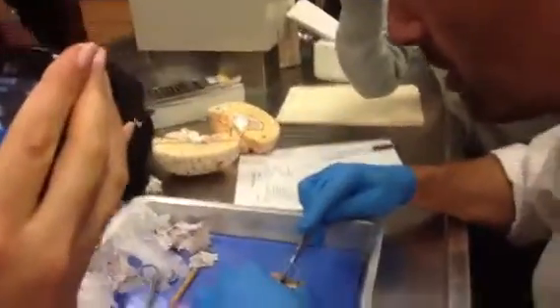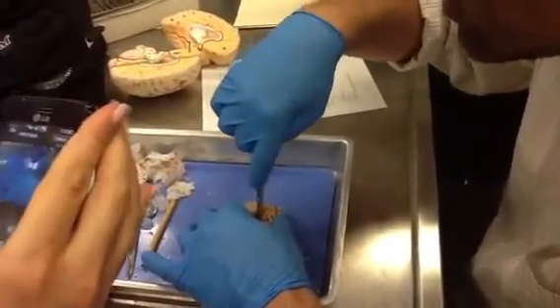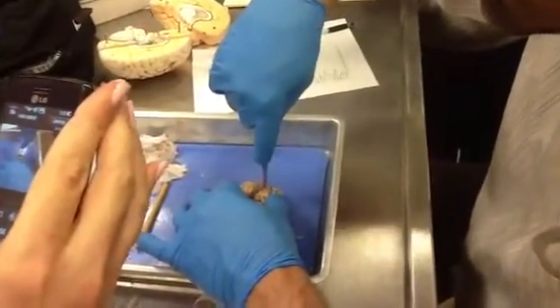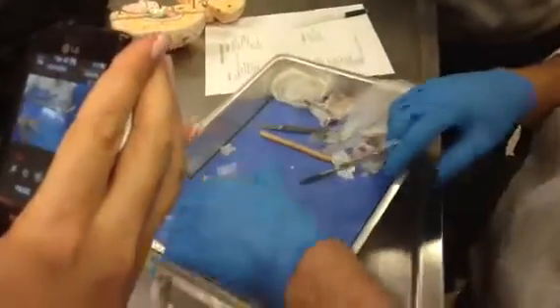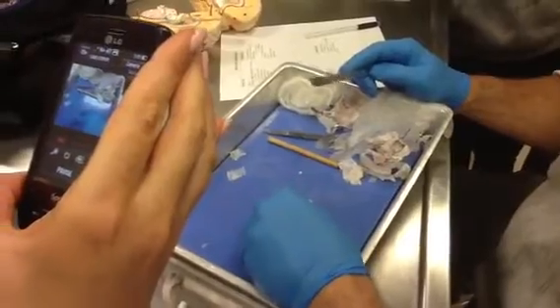So what I'll do is I'm going to come like this, I'm going to put it in, and I'm going to stand the scalpel up and slice down. And now I can lift it up and I can just pull it towards the front like this. Okay? And now what I'll do is, for the cerebellum, I really actually just squeeze it together in my hands.